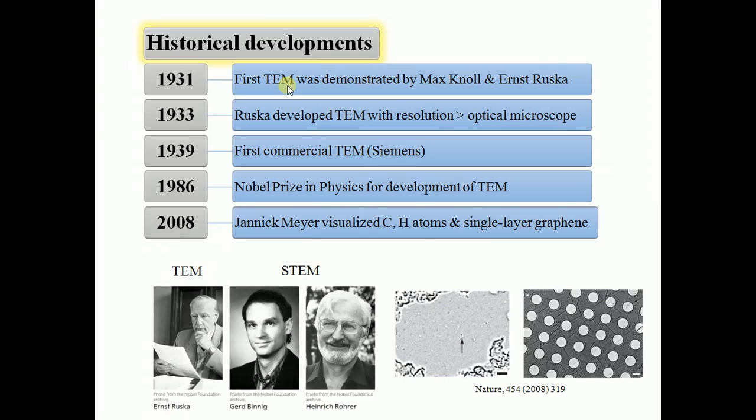Later on, Ruska, in 1933, developed a TEM with resolution greater than the optical microscope. Earlier microscope resolution was not higher than the optical microscope. The first commercial TEM was developed by the Siemens company in 1939.